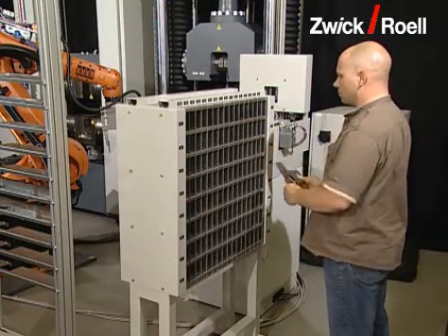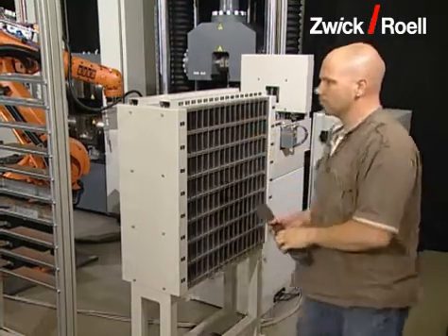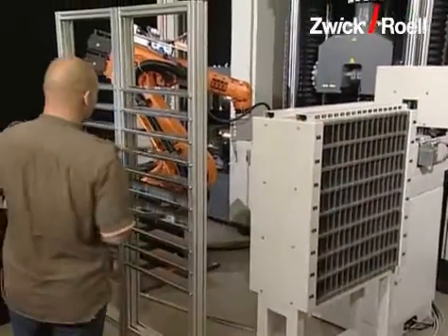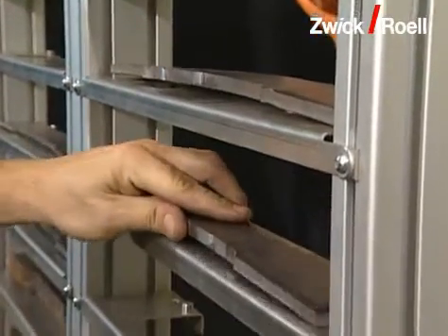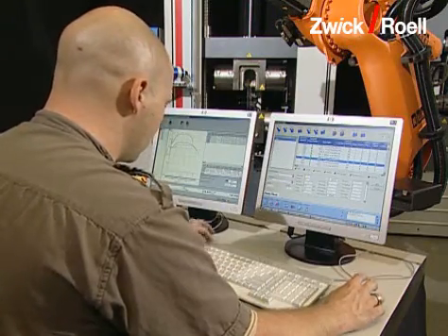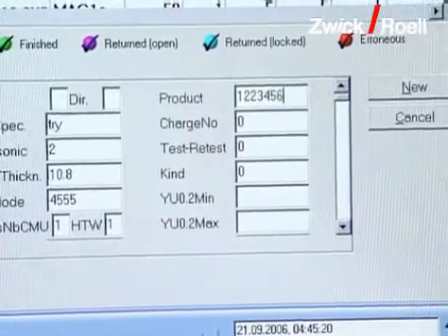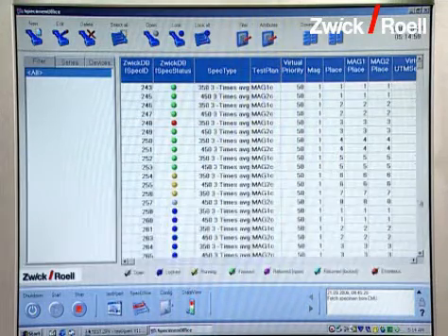A heavy plate specimen for the automatic tensile test runs through the following sequence. The operator sorts the specimens at the back of the magazine into their appropriate specimen places. Then the data of the test series are entered in the computer by the operator. Alternatively, this data can also be transferred automatically from a higher order host computer.